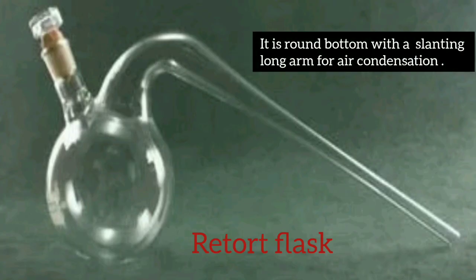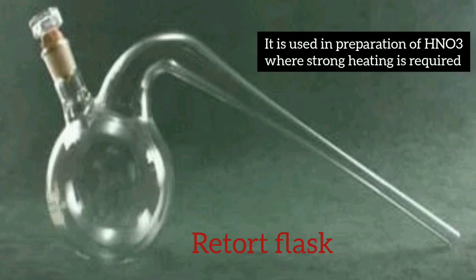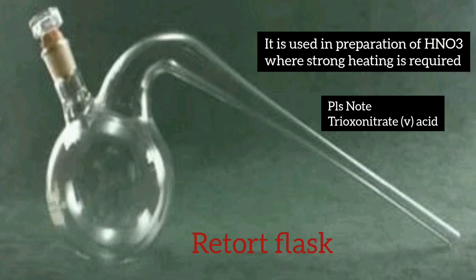Retort flask. It is a round bottom flask with a slanting long arm for air condensation. It is used in preparation of HNO3, that is trioxonitrate (V) acid, where strong heating is required.